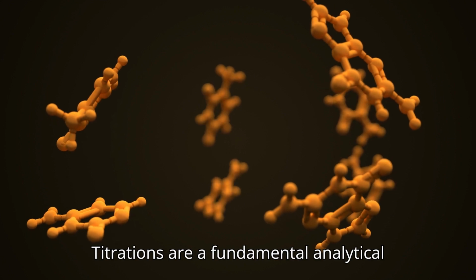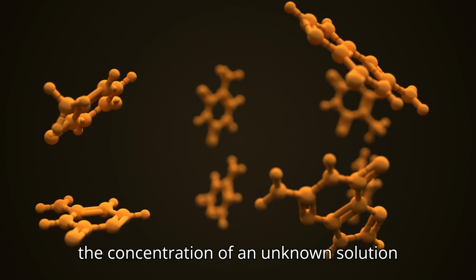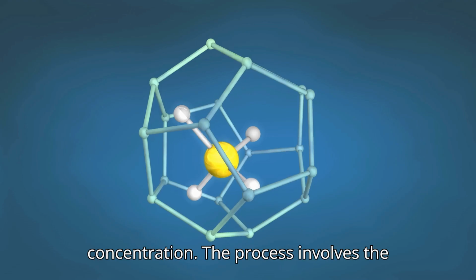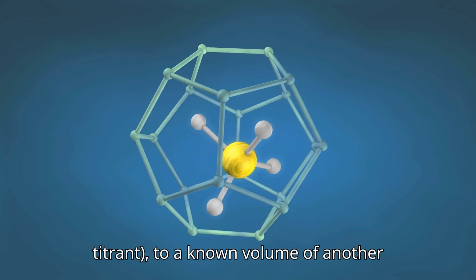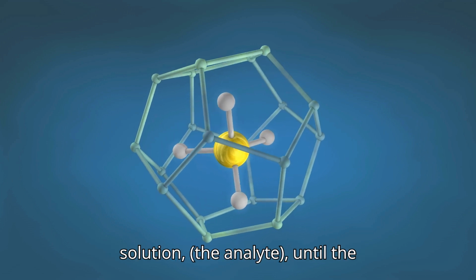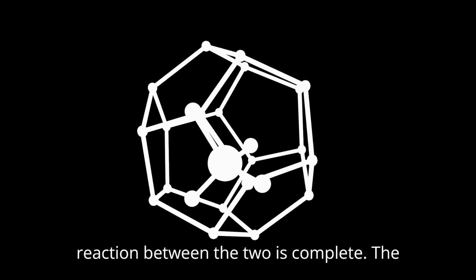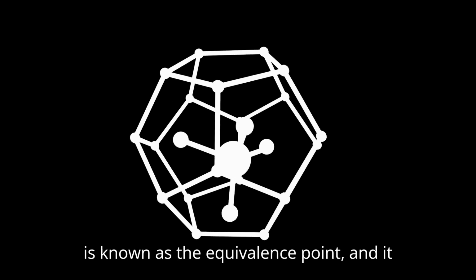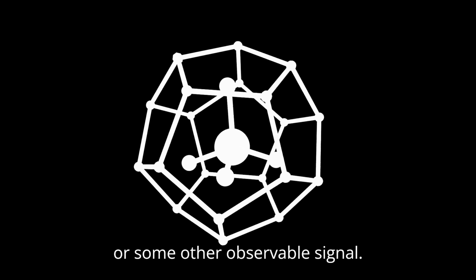Titrations are a fundamental analytical technique in chemistry, used to determine the concentration of an unknown solution by reacting it with a solution of known concentration. The process involves the gradual addition of one solution, the titrant, to a known volume of another solution, the analyte, until the reaction between the two is complete. The point at which the reaction is complete is known as the equivalence point, and it is typically indicated by a color change or some other observable signal.